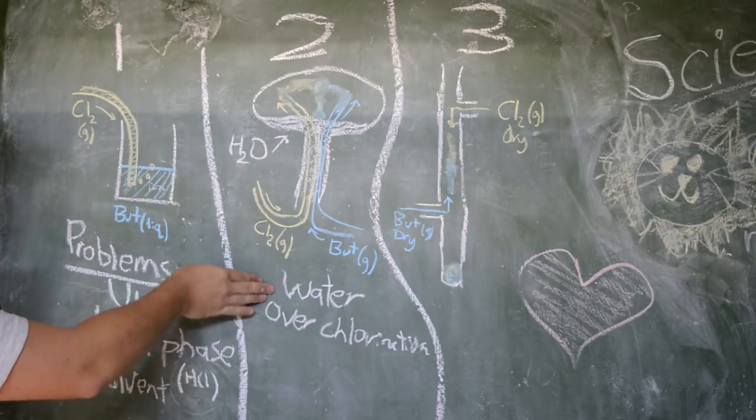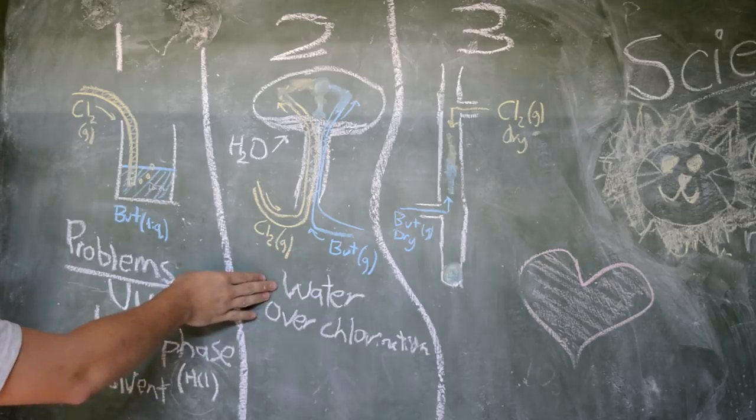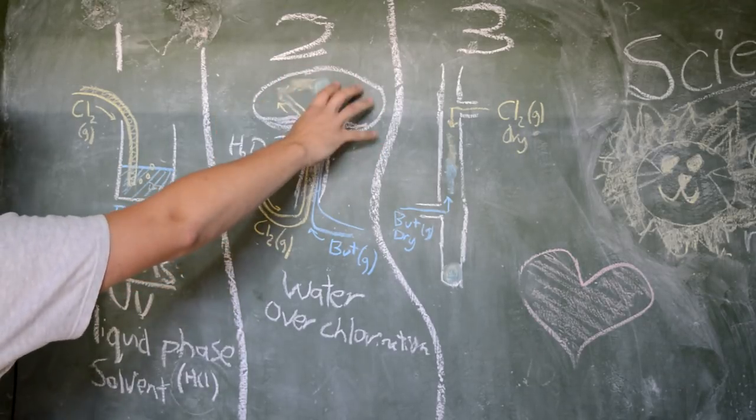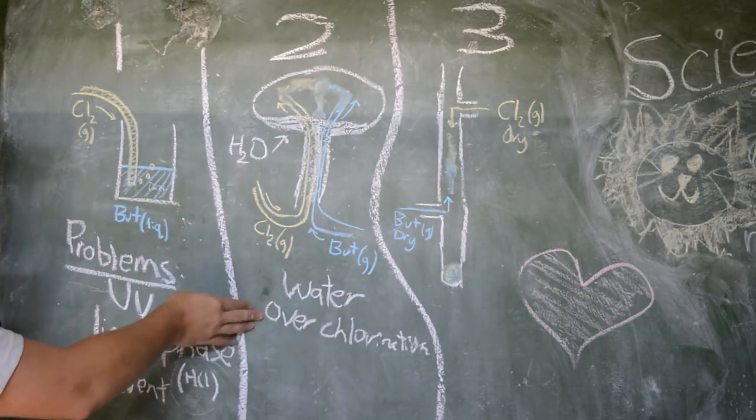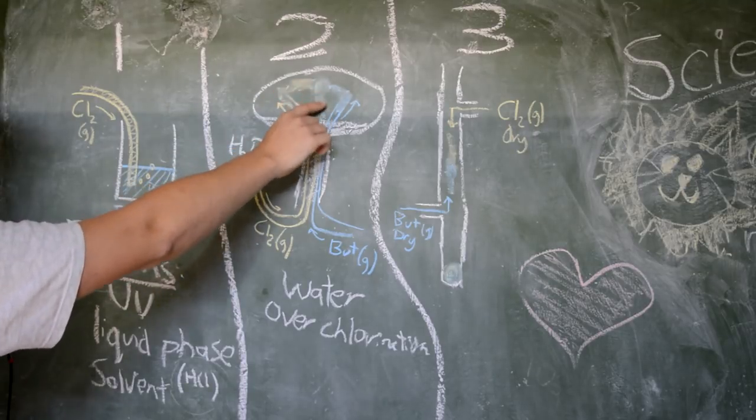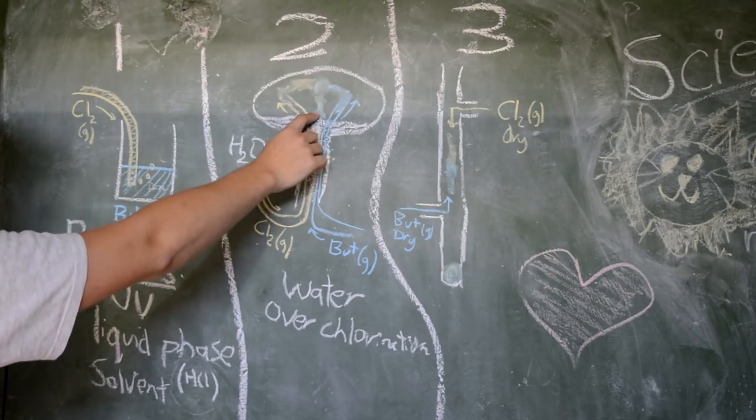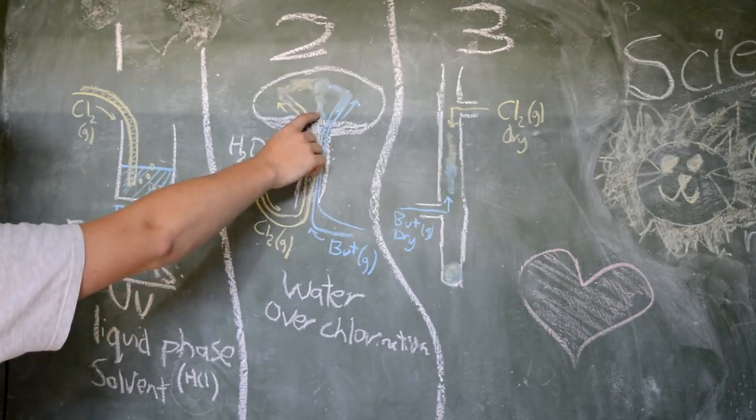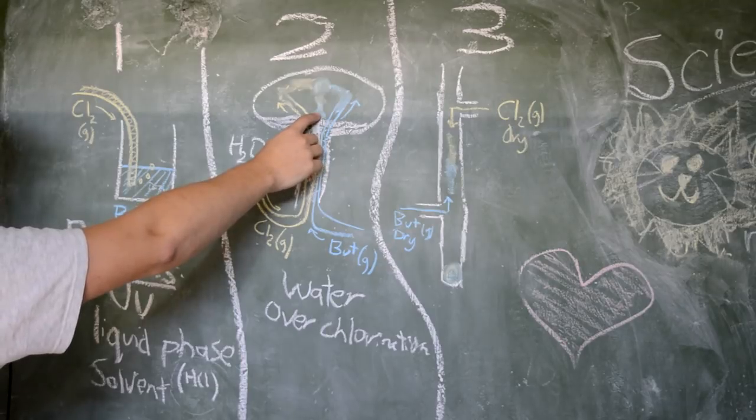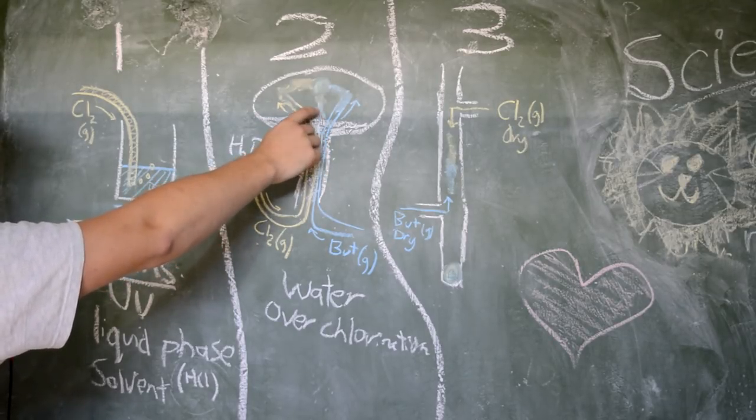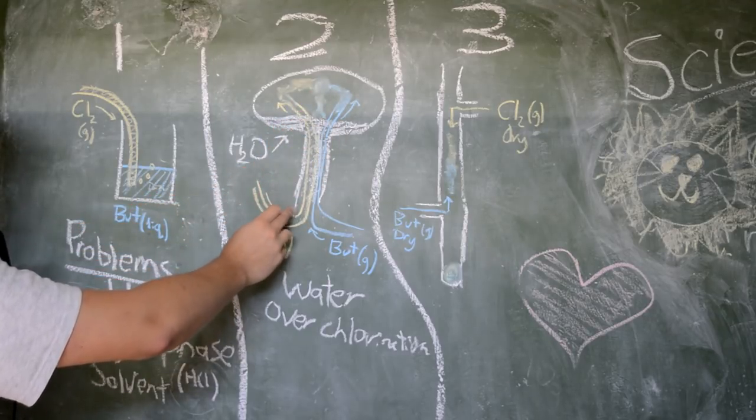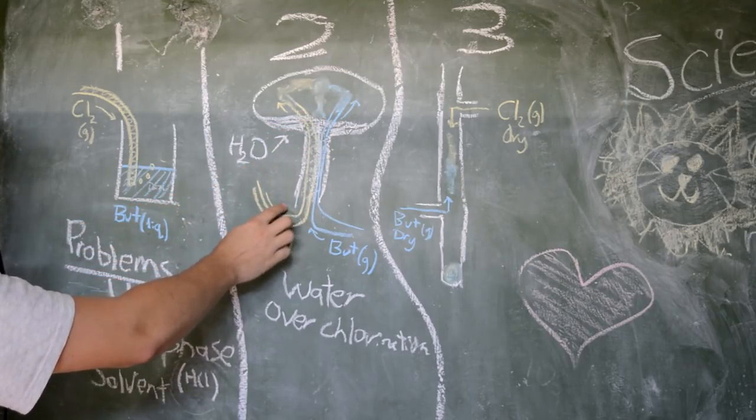The main one, of course, and pretty much everyone sort of thought this was going to be quite an issue was that there was a lot of water in this setup. So this whole gas phase area is just absolutely saturated with water vapor. Overchlorination too, because when our gases mix and form the liquid, it would float on top of the liquid there. And then the only way we could collect it was when it for some reason sunk.